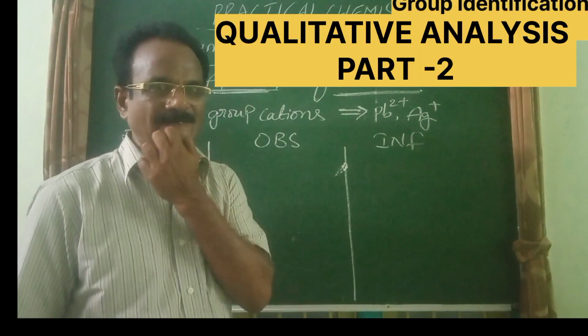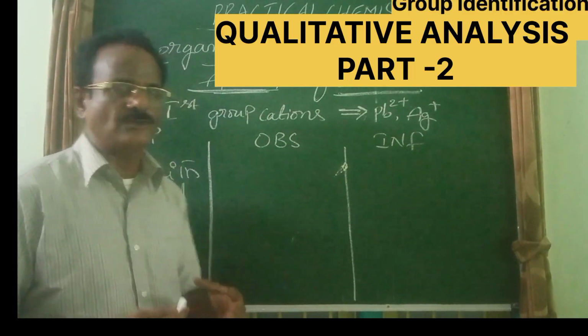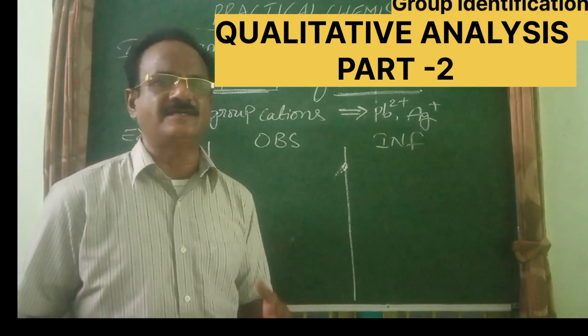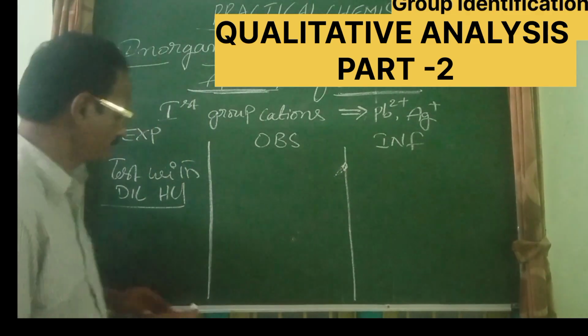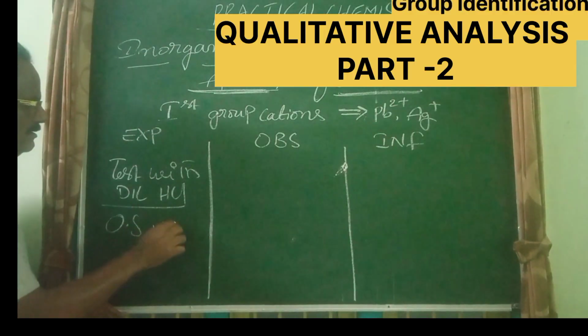Test with dilute HCl. Here the original solution of the given salt is to be added with dilute HCl. I am taking OS for original solution.